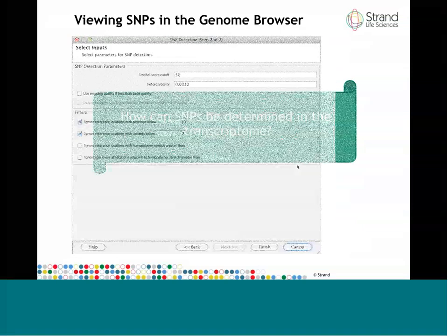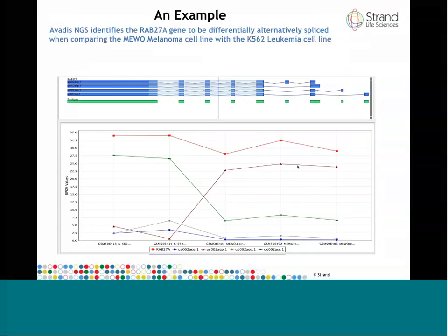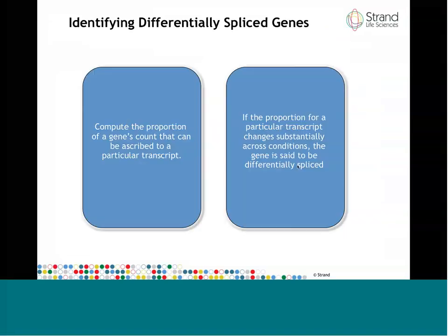or, if you wanted to find genes which are differentially spliced but not differentially expressed, you could use the Venn diagram functionality to intersect the two lists and find regions that are unique to each of the lists. So you take the differentially expressed list, the differentially spliced list, and just take the symmetric difference, the part that is unique to each list. That will give you a list of genes that are differentially expressed and not spliced, and vice versa. And you can find the intersection as well, of course.